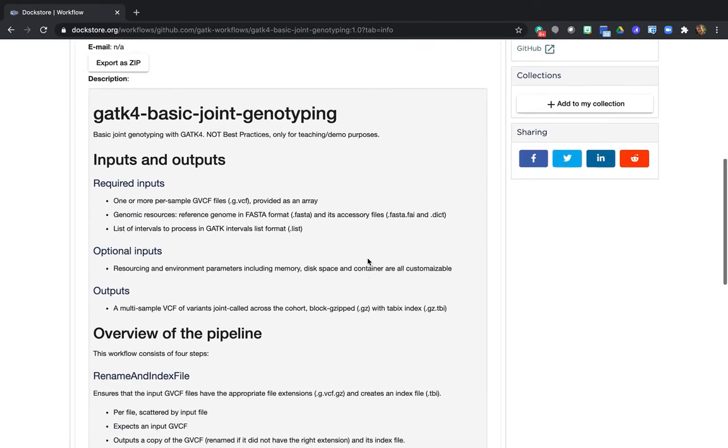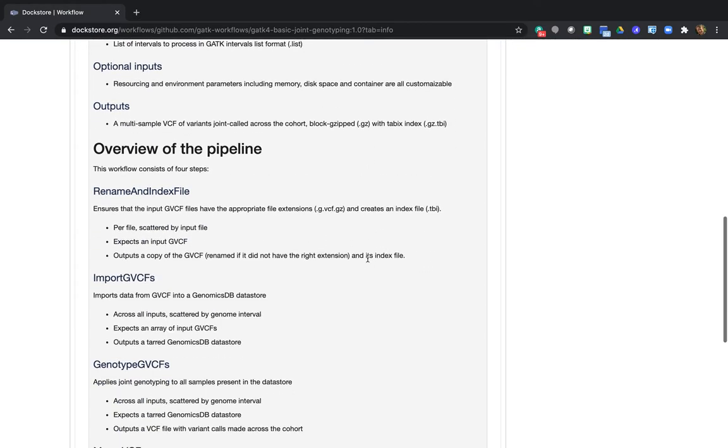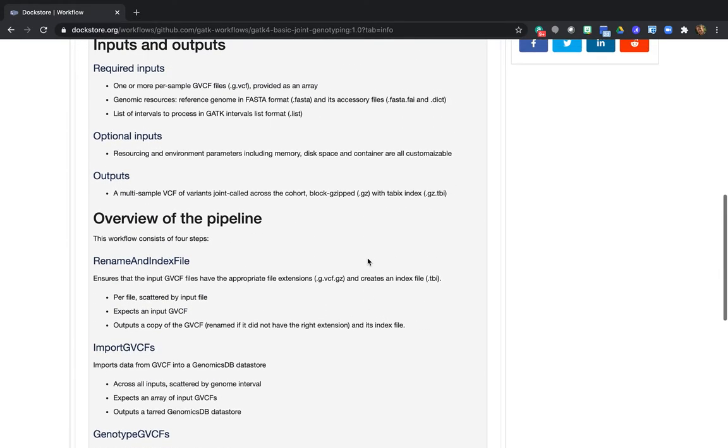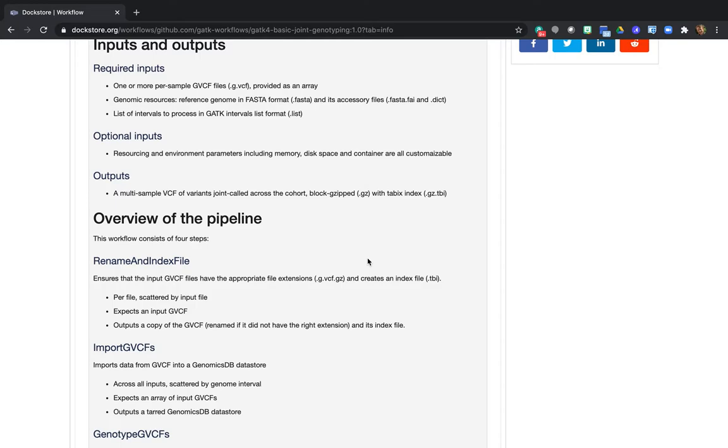The documentation describes the input requirements, outlines content of the workflow and just tells you what to expect. But for now, you just need to know that the workflow expects a list of GVCF files as its main input, and then it will run joint genotyping with GATK to produce a final VCF of variant calls for the whole cohort, which is exactly what we want.